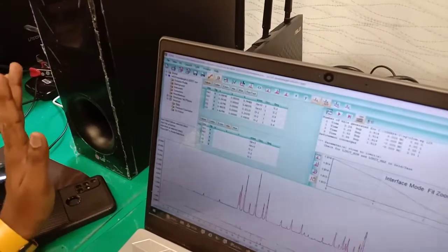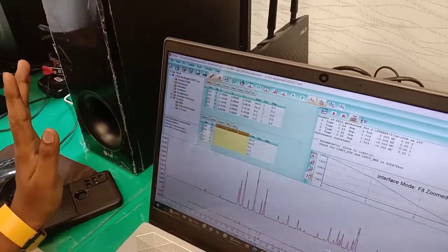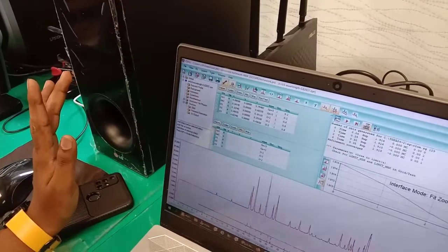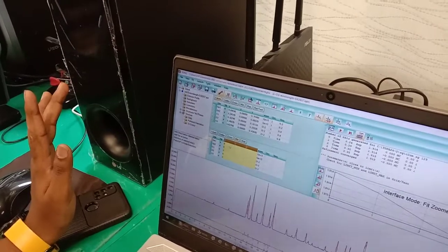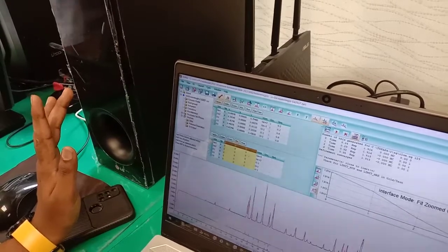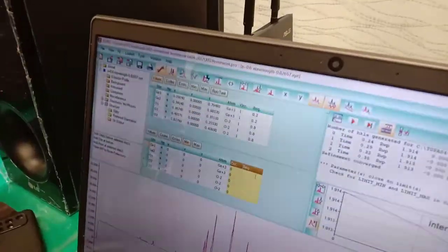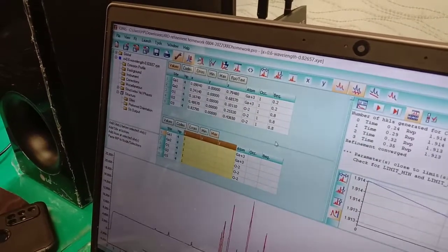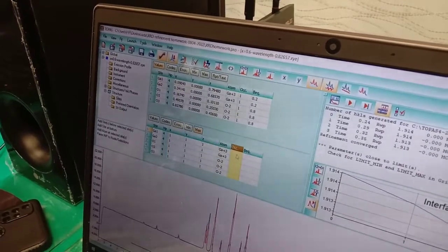As I said, generally XYZ will be 0 to 1, right? So the minimum should be 0. Here Topas is more convenient. You just choose, it turns yellow. You put 0 and press enter. Everyone will turn into 0. Zero enter, zero enter. Similarly OCC and BQ are also 0 to 1. Set the maximum to be 1, and occupancy will be maximum 1.